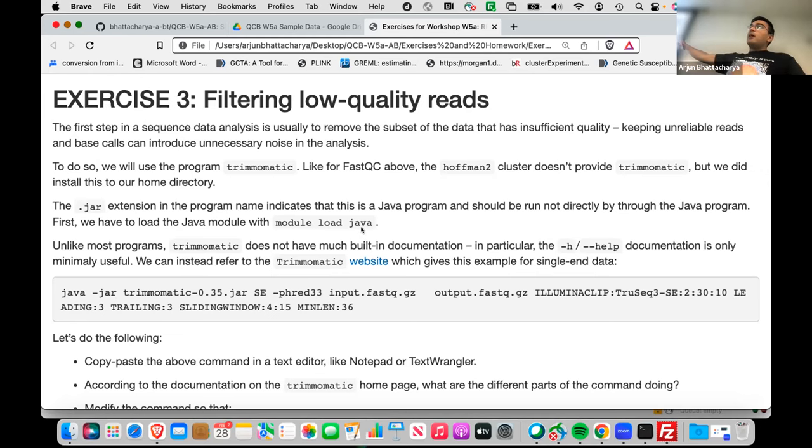That's exactly why we downloaded Trimmomatic. It trims reads, and if they get trimmed too much, they get thrown out. It's also aware of what adapters exist in our data set, so that it doesn't trim too much just because it's picking up on an adapter. This is precisely why we downloaded Trimmomatic, and this is where I'm going to turn it over to you to play around with this software.